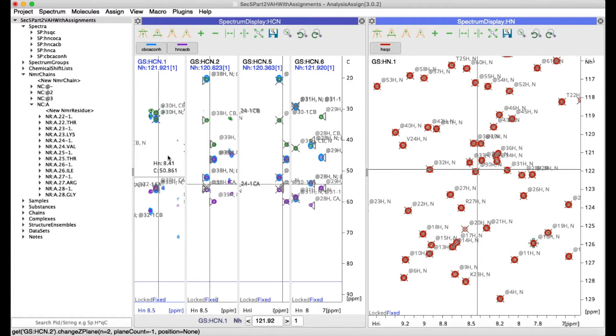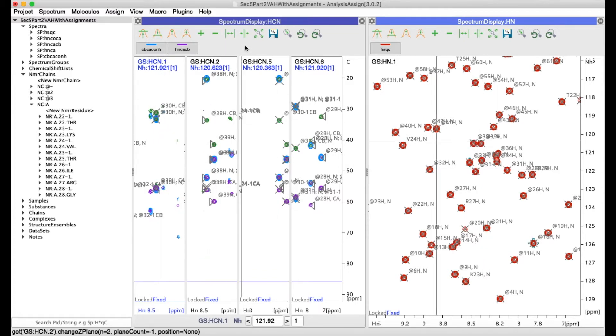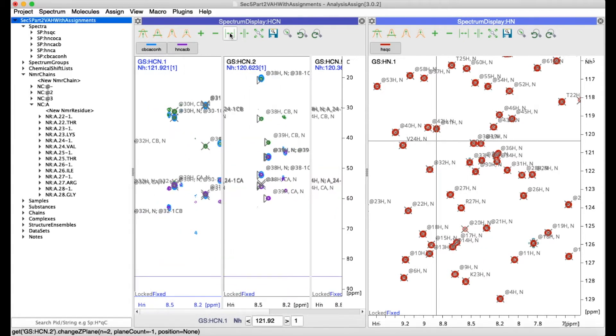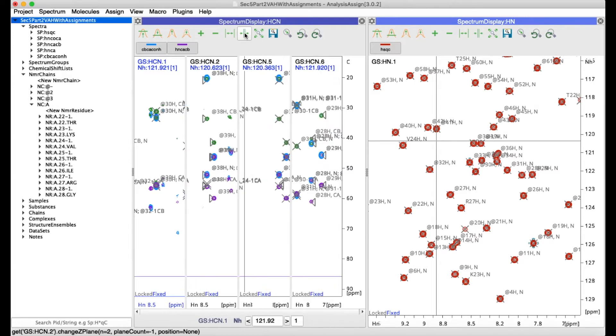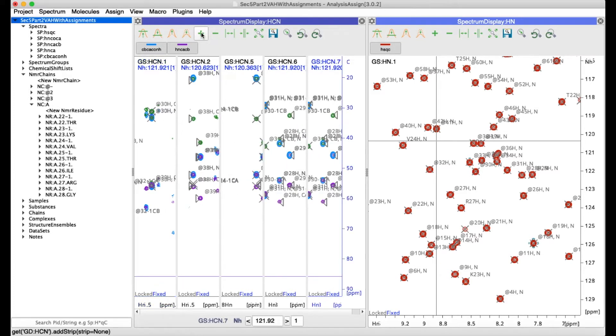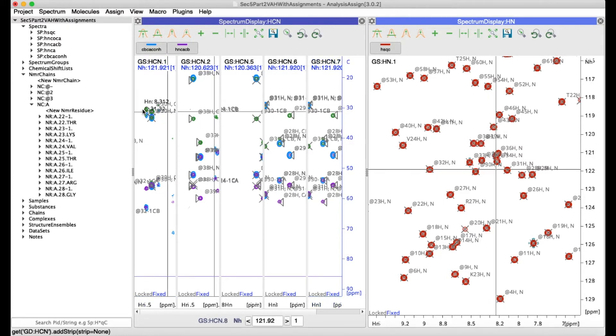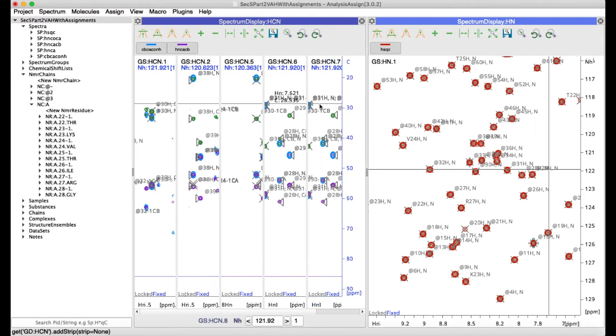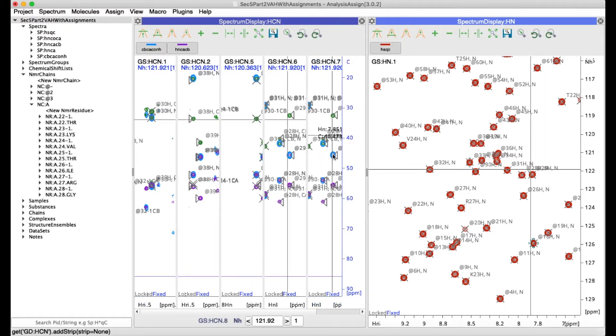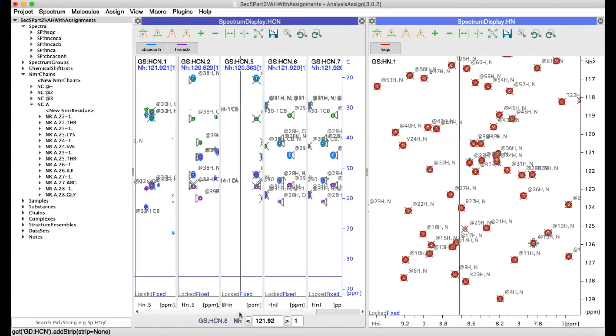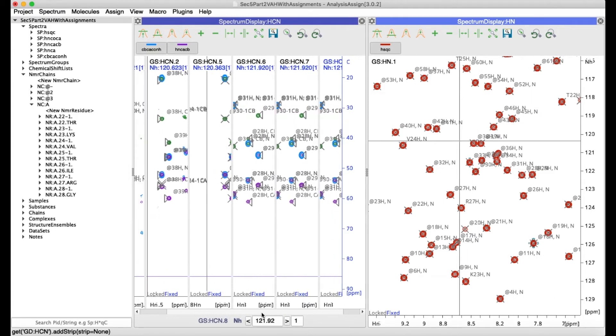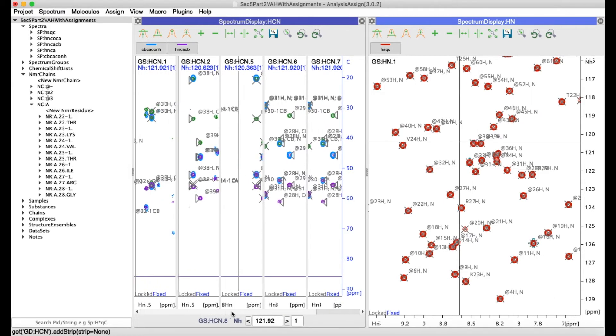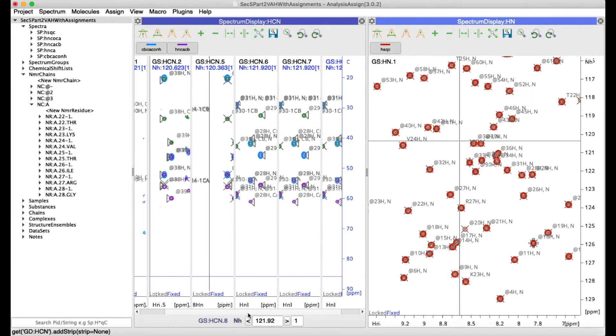You can make your strips wider or narrower using the buttons at the top of the toolbar, and if you have too many strips or your strips are too wide to display in the spectrum display you will get a scroll bar at the bottom for you to move through them all.